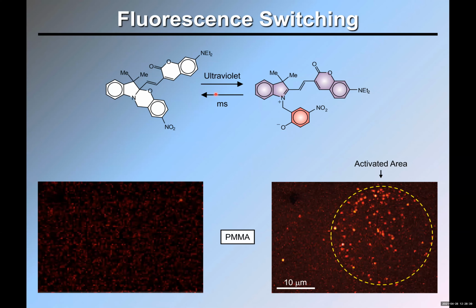One laser has a wavelength of 355, and it uses the photochemical conversion of this species into that. And then we have a second laser of 535, which excites the photochemical product to produce fluorescence. But do they have to be synchronized or something, or no? So this is done with CW lasers. So they're both on all the time. Oh, it's on all the time.